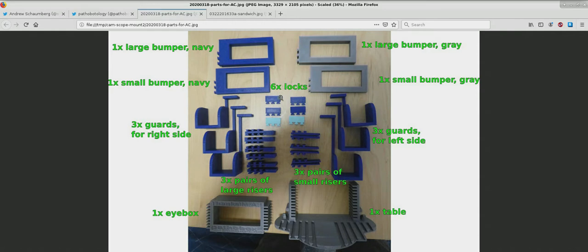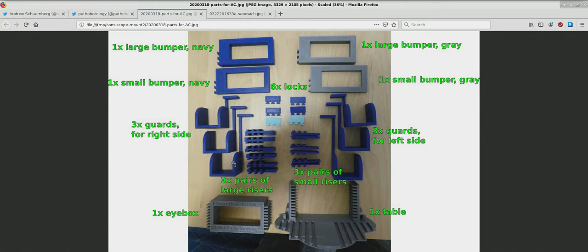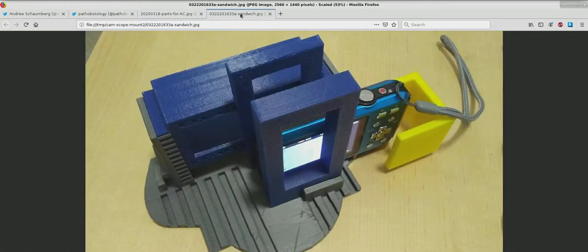I'd like to briefly focus on these locking parts that fit most snugly into the table, and the large bumpers which are multi-purpose, as well as the guards.